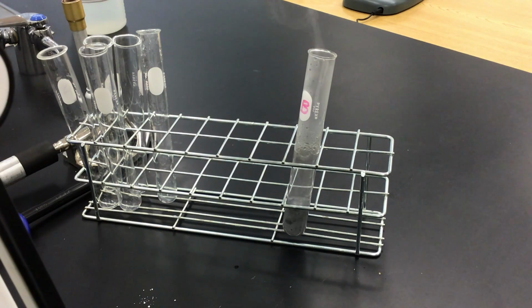All right, so 2 evidences of chemical change in this demo are heat produced and gas produced. We also have a little bit of a color change, but those are our big 2: heat produced and gas produced. Look at that one go. It took a second to get going, but once it gets there, it's pretty awesome.